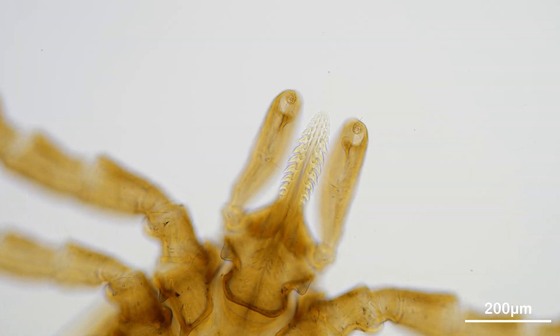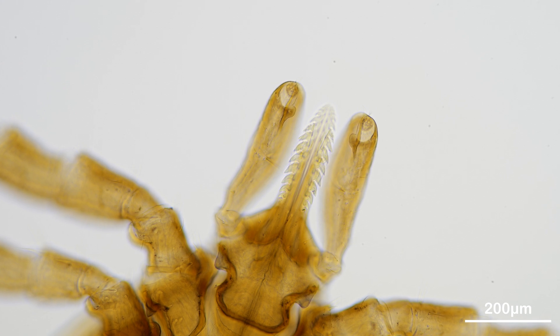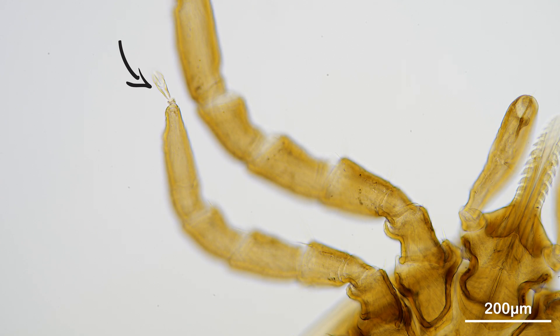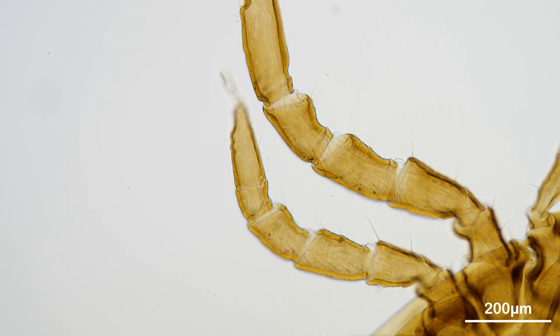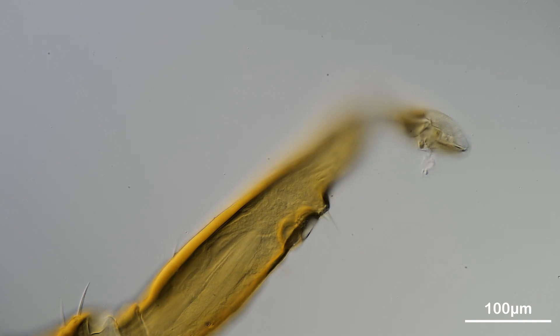Now we can take a look at this tick in brightfield using a 10x objective. We are looking at the juvenile tick from the genus Ixodes and I'm currently focusing on the hypostome, which is the barbed mouthpart that anchors the tick to its host. Flanking the hypostome on both sides are the so-called palps — these sensory mouthparts fold back during the blood meal. Looking at its legs, we can see that there are also some hooks on each end to attach to a passing by host. However, a truly remarkable feature resides on their front legs: the Haller's organ. This specialized sensory organ plays a pivotal role in the tick's quest for both hosts and mates, sensing humidity, pheromones, carbon dioxide and temperature. It functions similarly to the antennae of insects, housing chemosensitive cells within its cavity. Astonishingly, this organ even employs infrared detection to perceive the radiant warmth emitted by potential hosts.